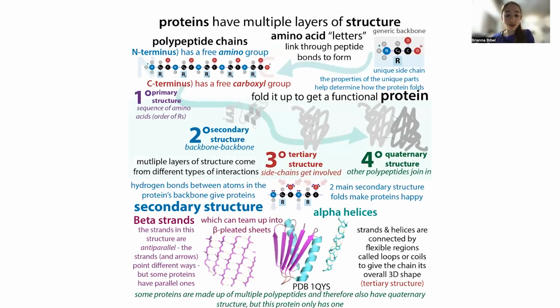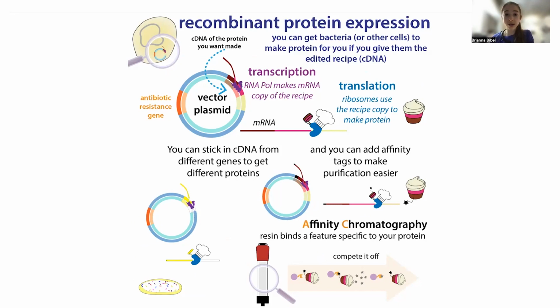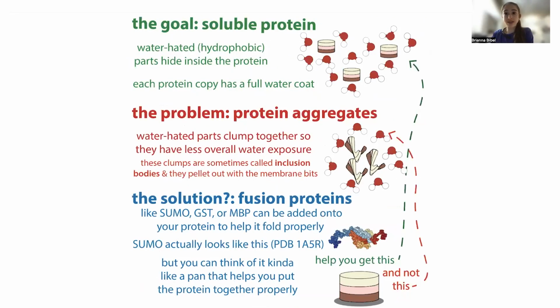But sometimes things don't go according to plan, because even though these cells are able to read the recipe, they might not want to make the protein. You might have problems with expression, so actually getting that protein made. You might have problems with the stability of the protein, and a big problem often is solubility, where basically the protein is going to come out of solution. It's going to clump up and aggregate. This can collect in what we call inclusion bodies, where you have these clumps of misfolded proteins. And there are ways where you can actually purify out those clumps and try to renature or refold the proteins. But ideally, typically, you want a nice soluble protein.